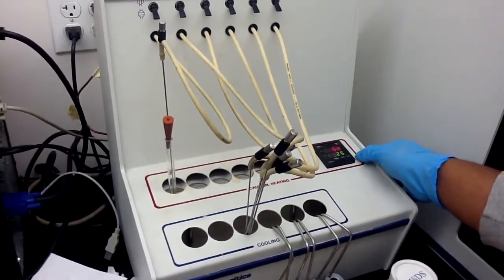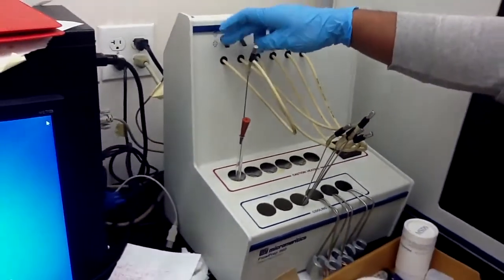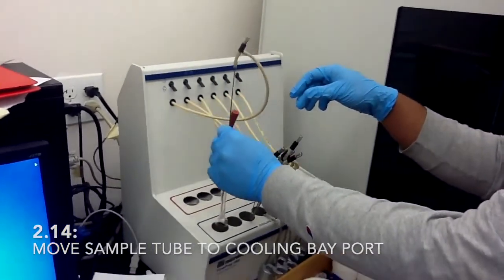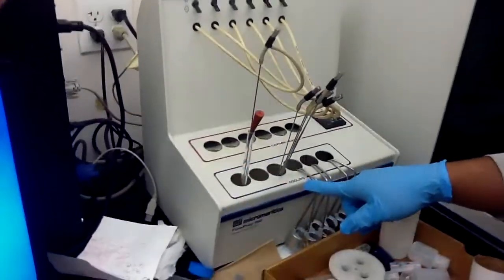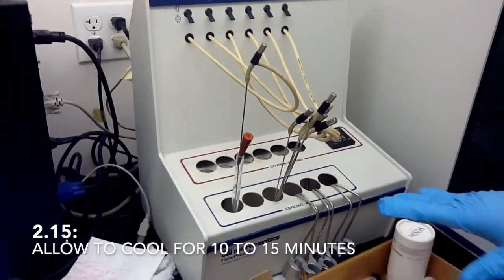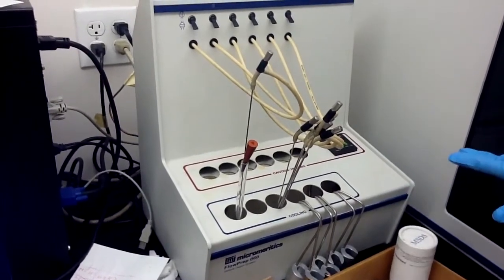Alright, now it's 25. Now you close this bulb, then you need to take out this tube and put it here. This is the cooling section. Just keep it like this for 10 or 15 minutes. After this, your sample will be cooled down.